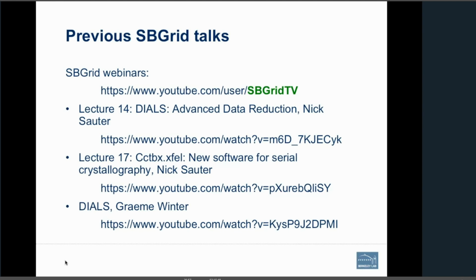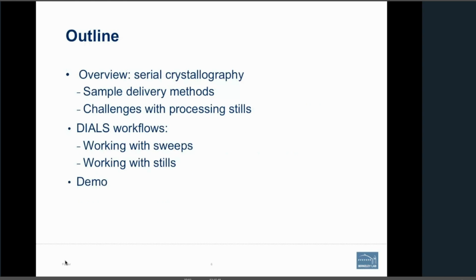So these groups have given other SBGrid talks. If you go to the SBGrid YouTube channel, you can see talks by Nick Sauter and Graeme on DIALS and cctbx.xfel.